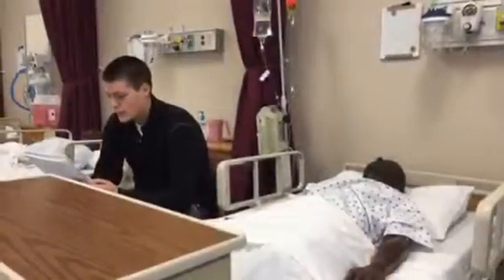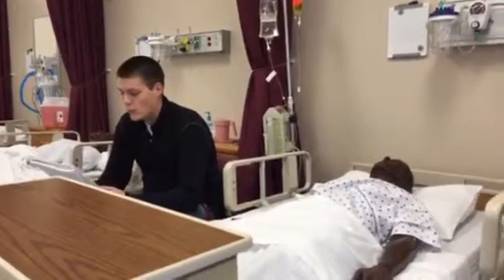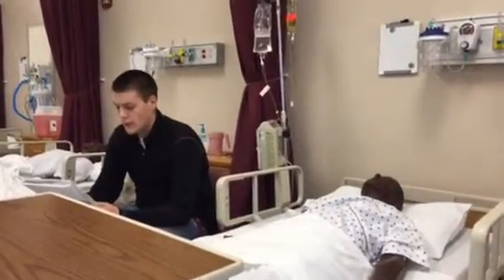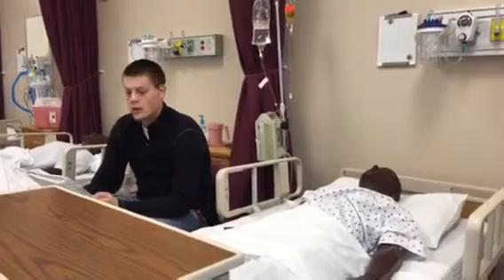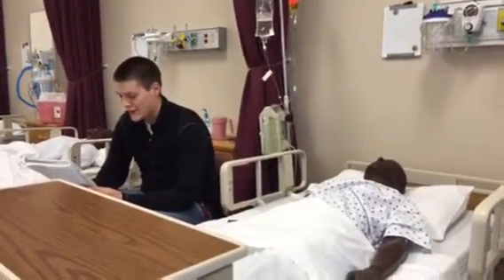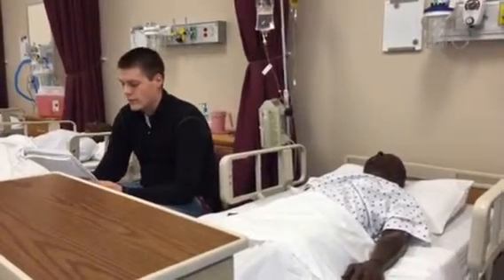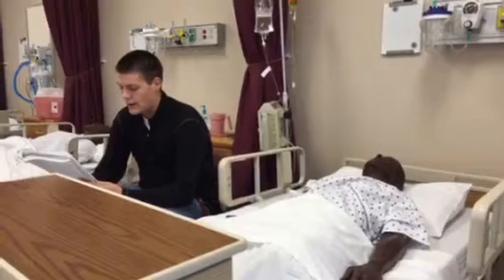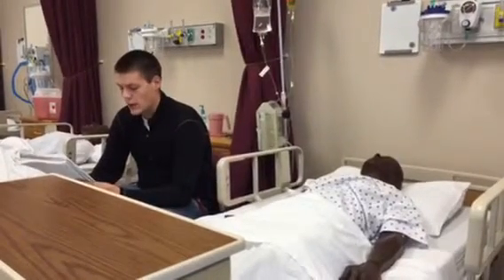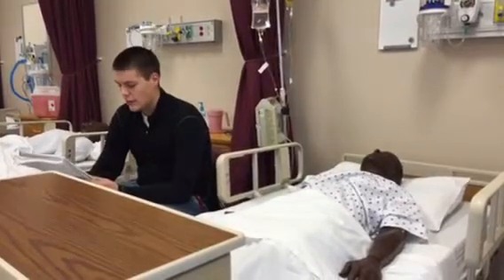In this experiment, we measured the weight of the crucible and then placed the compound in the crucible. Then we put it over a flame until all crystals turn brown. Then we measured the mass of the sample by subtracting the crucible weight from the total weight. Then we transferred it to a 50 milliliter beaker and added a 20 centimeter piece of aluminum wire. After that, we added 5 drops of 6M HCl.